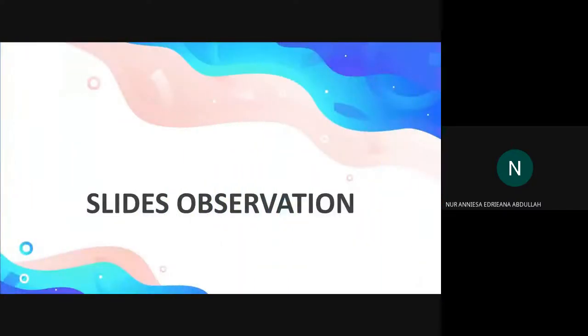Now, let's continue with slide observation. You will learn the right way to use a microscope, so make sure to give 100% attention to the demonstration. We will use the plant cell as an example.